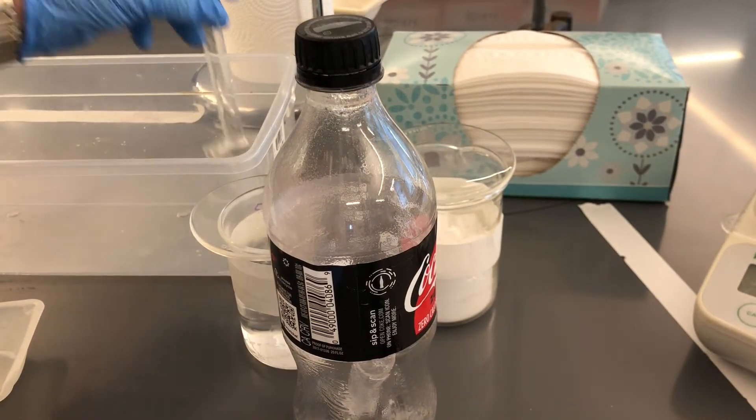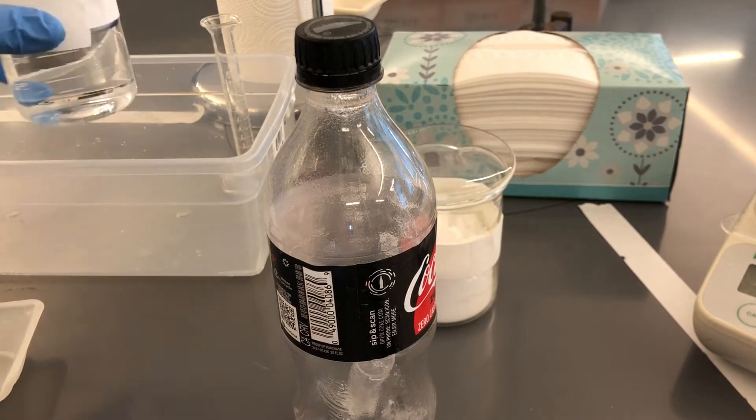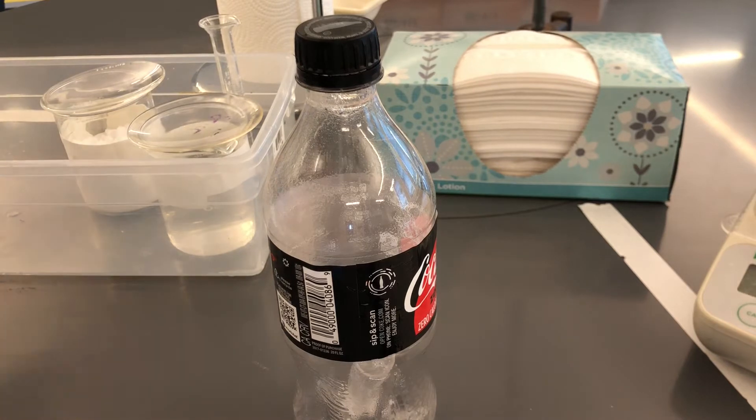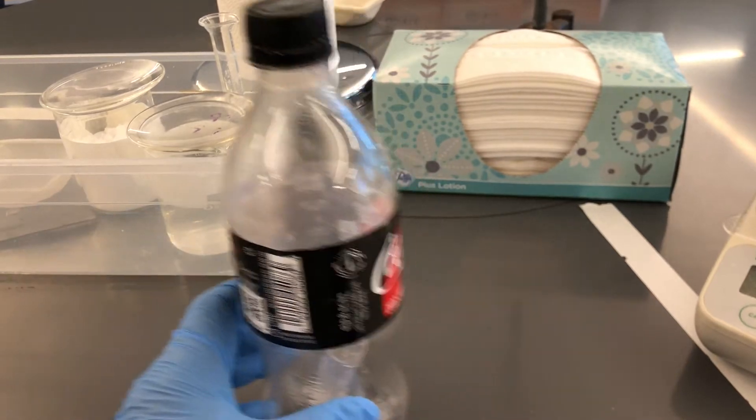But we're not done yet. We've got to put everything away. We're going to put everything back in the bin and we're going to have to clean out the bottle. Turn the balance off, everything goes back in. The paper towels will be thrown away. If you've made any mess, wipe it up with the paper towels.